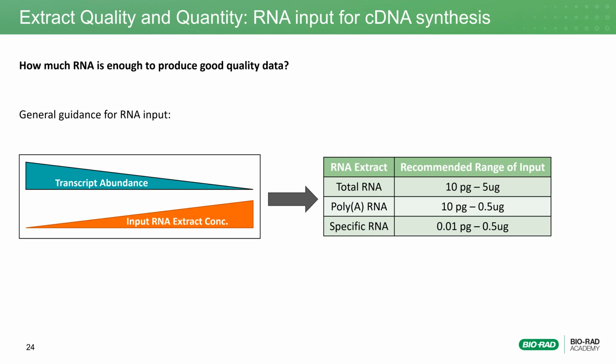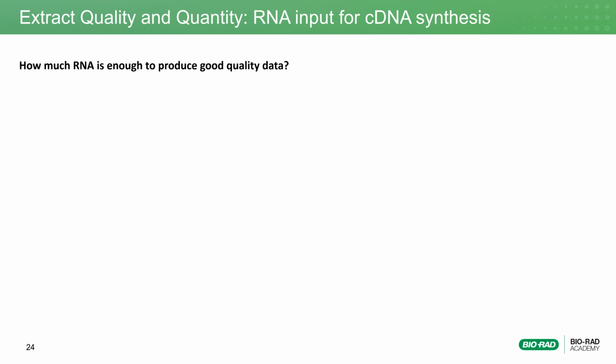in frequency, which means that the extract input requirement will be much higher in concentration when compared to an extract sample containing only a fraction of the RNA biotypes within a cell. Although the previous table can be helpful in dialing in a starting input extract concentration, the correct concentration ultimately comes down to trying a few different concentrations and examining your results downstream.